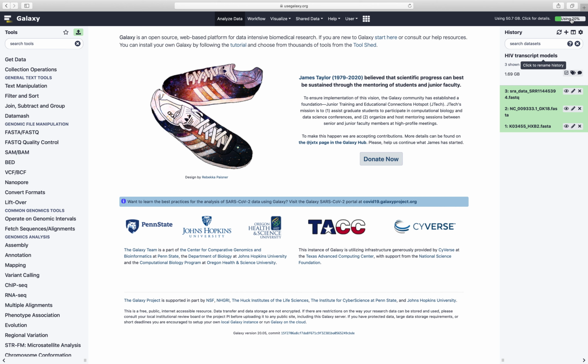and then we should have about the same if we were using the usegalaxy.eu. And then note that you can always ask Galaxy to increase your allocation for a period of time. So I've gone through this a few different times, but all of those needed to be erased. So I'm just going to go through what our files are.